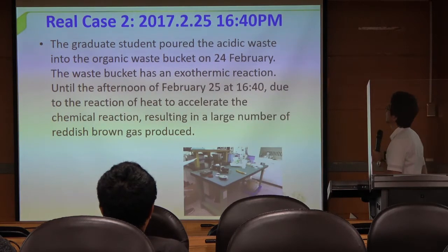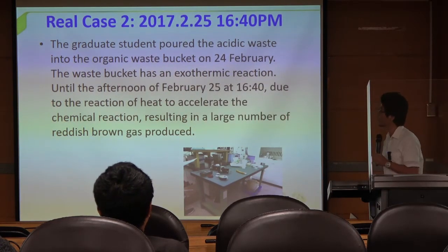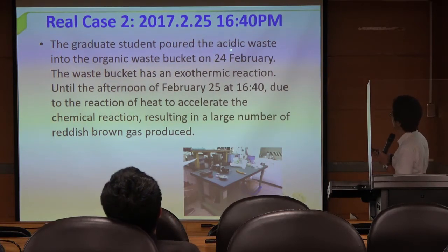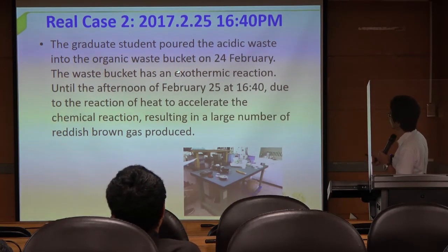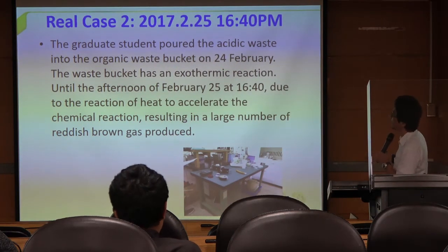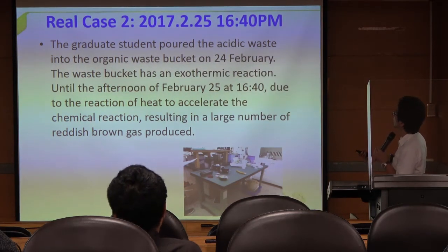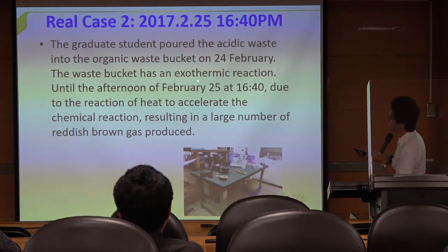Okay. Then case 2 happened in 2017. On February 24, a graduate student poured acidic waste into the bucket, and another person threw other reagents in. They put them in the same bucket, so those reagents reacted in the garbage bucket.